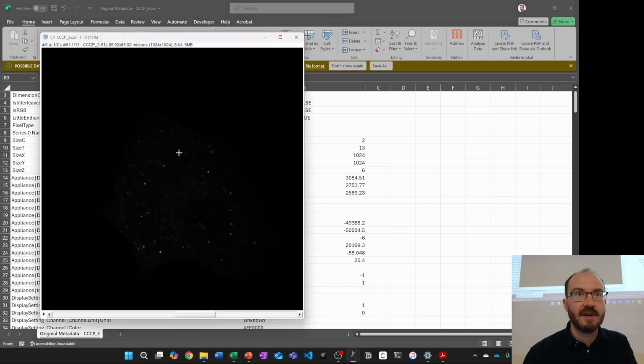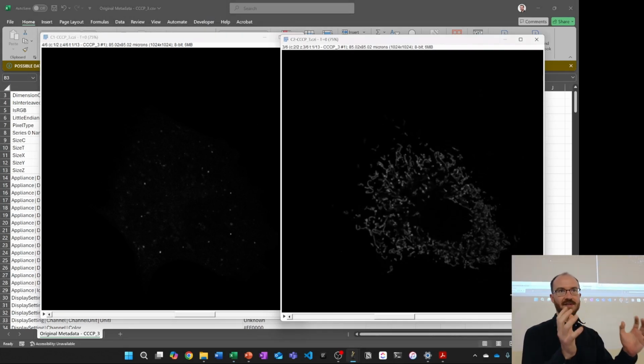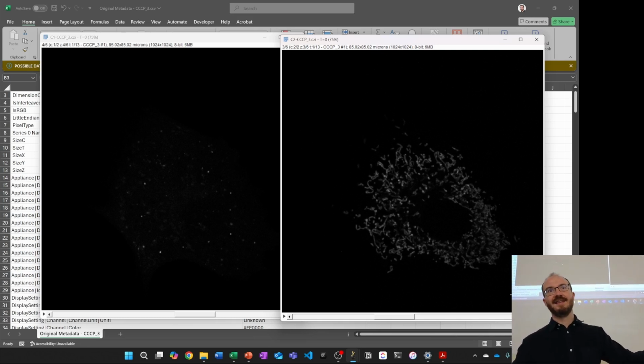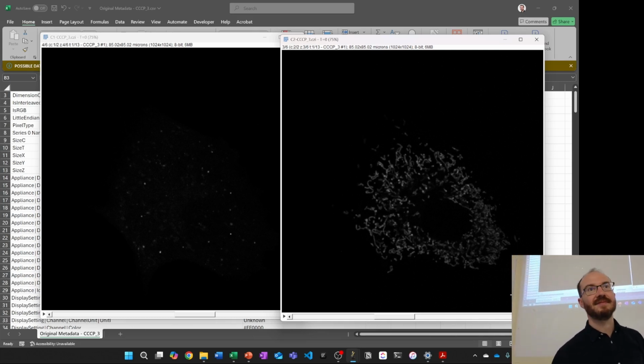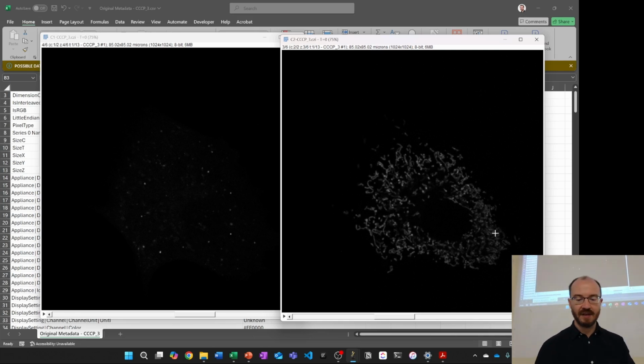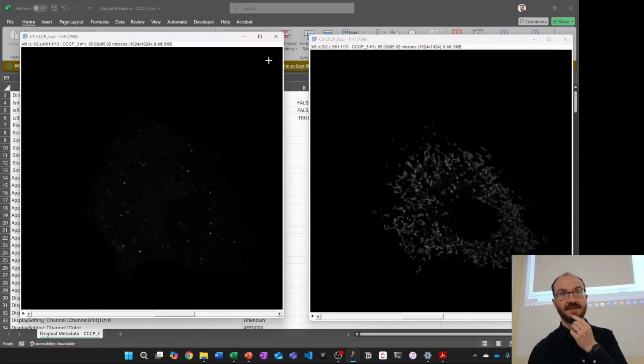What do you mean, like these two files for the different channels? Yeah, so there are two things here. For my entire sample set, which was a single file in this case, I need all of the metadata, which I get from that one file. There's metadata associated to everything. And then I need to apply deconvolution later, but for that I need separate images. So we need one CSV file, which is the metadata, and then two image files, which are the two images that we want to deconvolve just now.